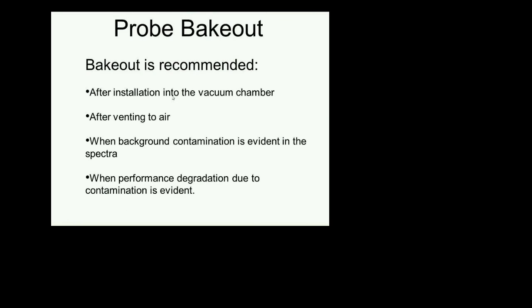And we talked a little about heating jackets. The question is, when do you bake out an RGA? The bake out is recommended. Certainly the first time you install an RGA, once you have the RGA sitting on a shelf, or it just got shipped to you, and you mount it on your vacuum system, I recommend that you do an overnight bake out. Every time you vent out to air, if you want to get to where the RGA can provide accurate results very quickly, bake out. Bake out, and if you can, bake out overnight.